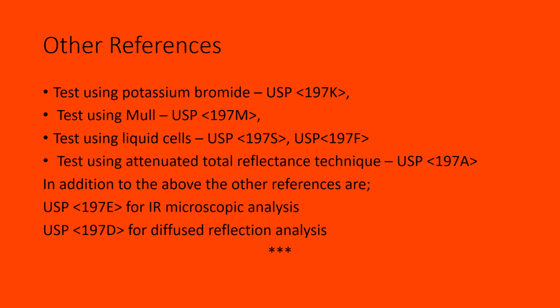Try to read and understand all the references made. You may refer EP 2.2.24 or IP, the Indian Pharmacopoeia 2.4.6 for more similar information. USP chapter 854 gives you more insight into the operation principles of the infrared spectroscopy.